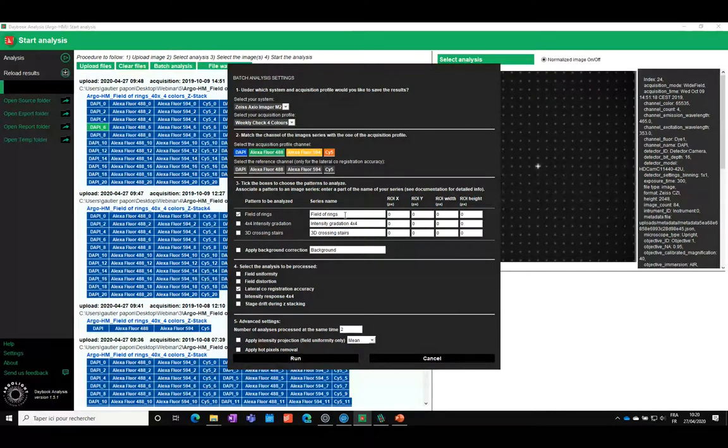Of course, you can change that. I could have used just rings or any type of word. I can also use numbers or random strings of words. It's only a way to match the content of the image with the patterns within the image. I can also add some region of interest if I always crop in the same way.